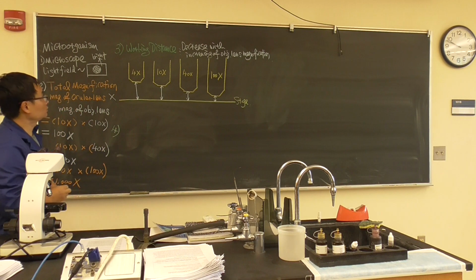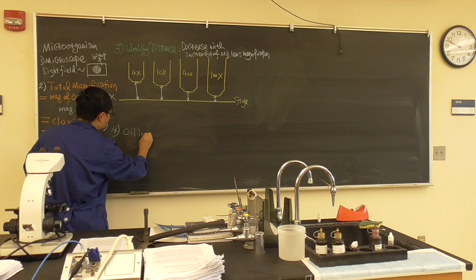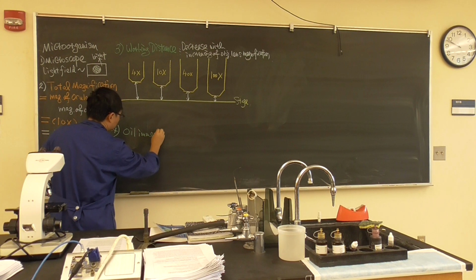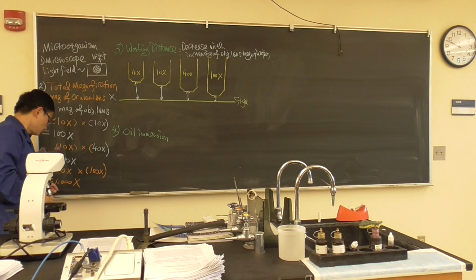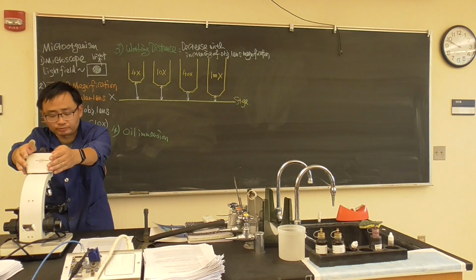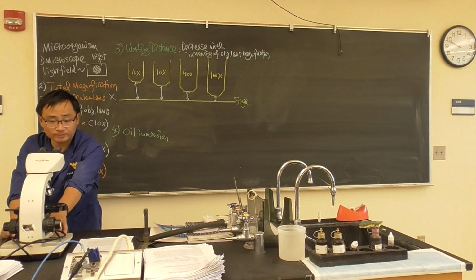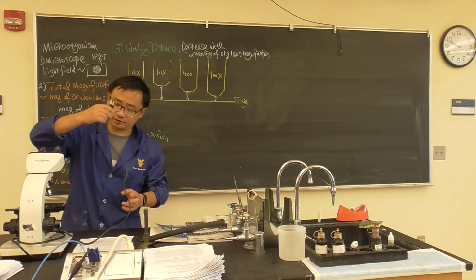It's called oil immersion. So what happened? These light field and bright field microscopes, the energy source is at the back, at the bottom. It is a light.